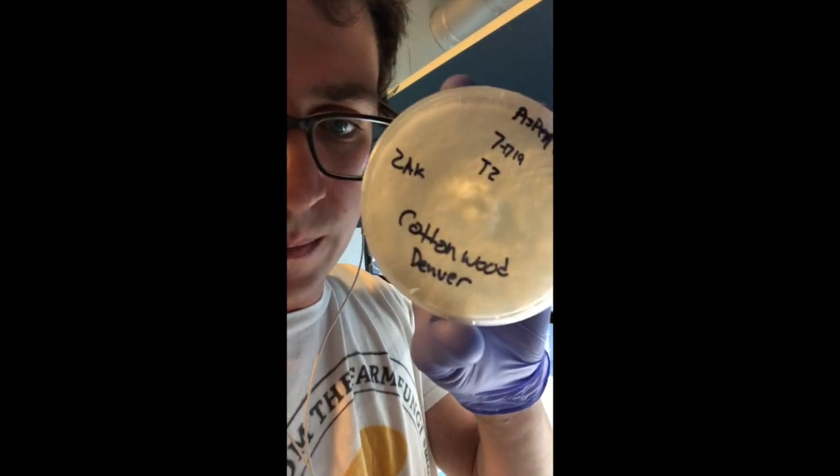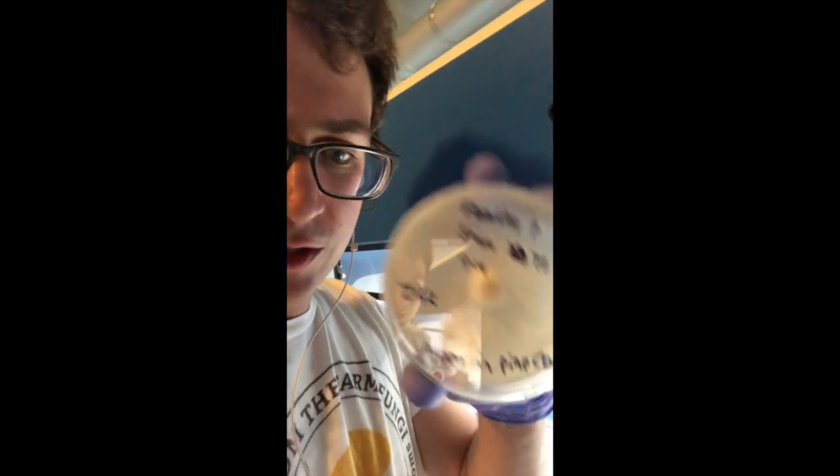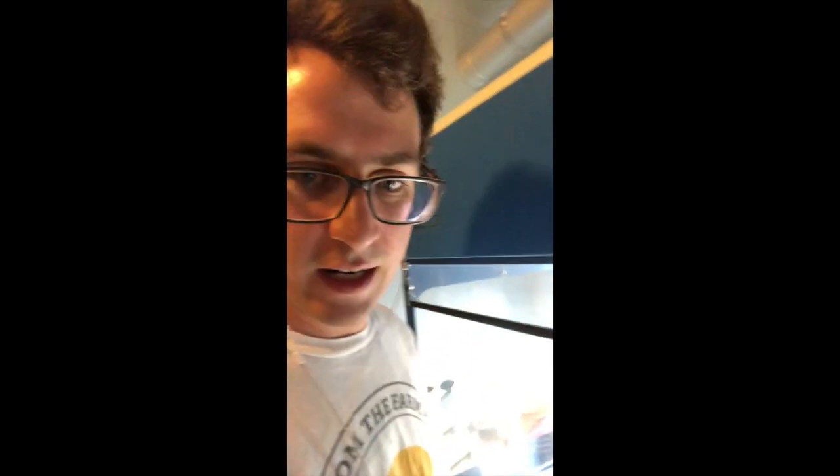It looks like he already did one transfer on this plate, but I'm going to double check before I put this on any grain agar. This culture looks really healthy — really bright white mycelium — as well as this enoki culture. I'm going to transfer these onto a plate, then transfer to a liquid culture, then into grain spawn, then do a bulk substrate, and then put it into the fruiting chamber.